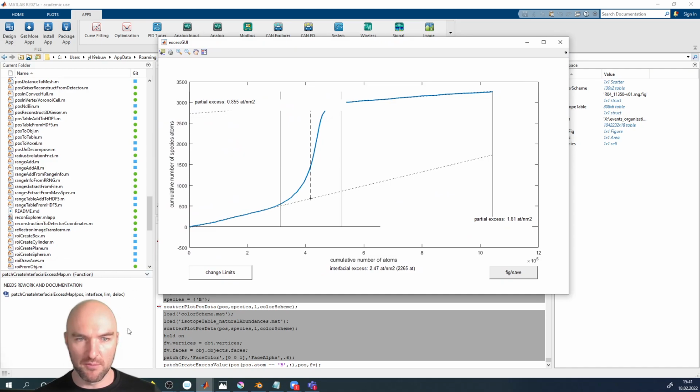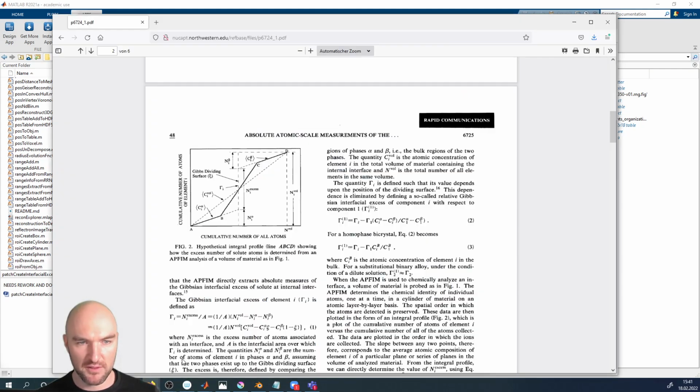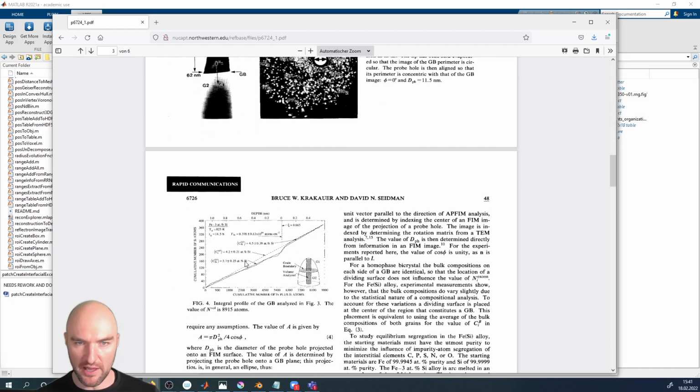But obviously on a modern atom probe, if we compare that to what we've seen just before, I think I did it in Firefox. Of course, if you look at this here, this is a one-dimensional atom probe. Here's the counting statistics. So you can see the cumulative number of atoms here is about, I don't know, 300 for the entire data set of 9,000.